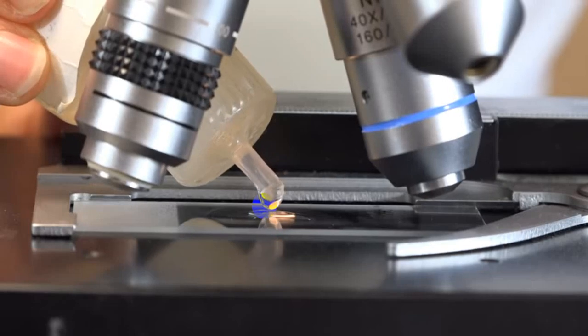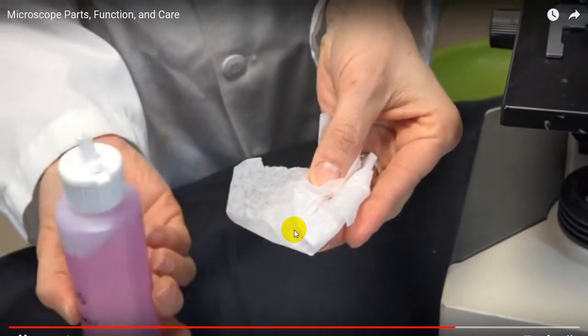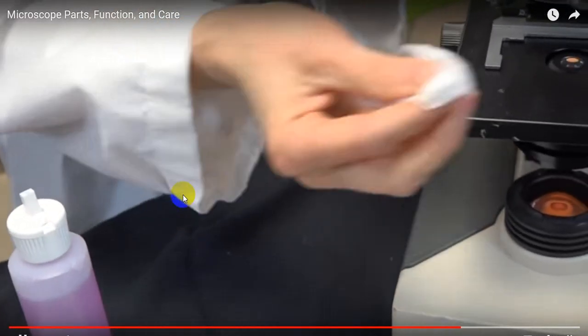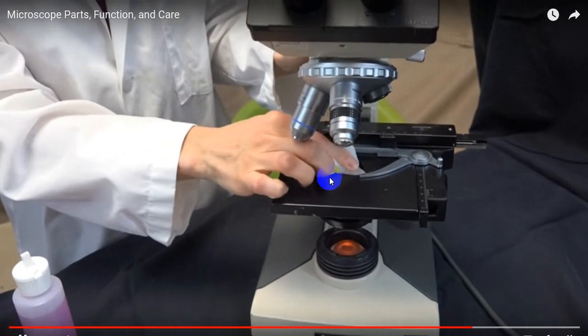If you use oil immersion on your microscope, use lens cleaner to clean off any oil and rub to remove it. This is a lens cleaner. If necessary, you can also use detergent to wipe the condenser, the stage and everything.